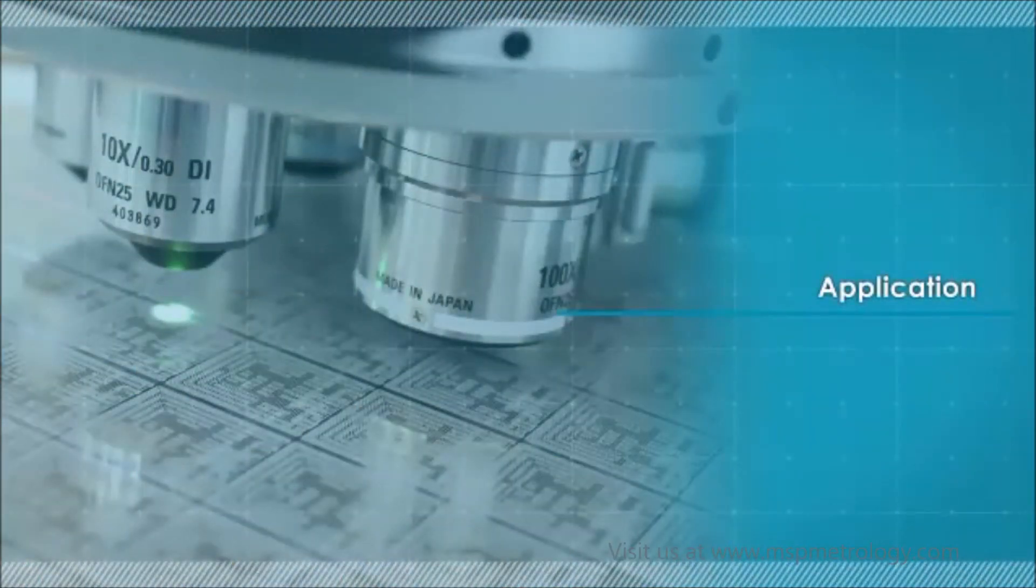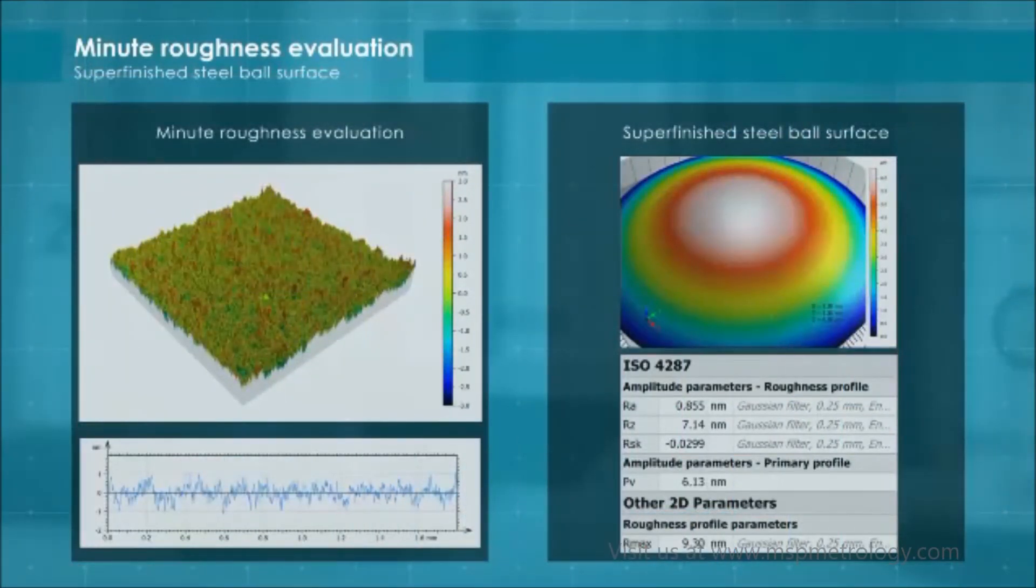Here are some actual application examples. This is the evaluation of a semiconductor wafer and super-finished steel ball surface. Nano-level fine roughness measurement can be accurately performed by the Optscope that uses the principles of white-light interference.